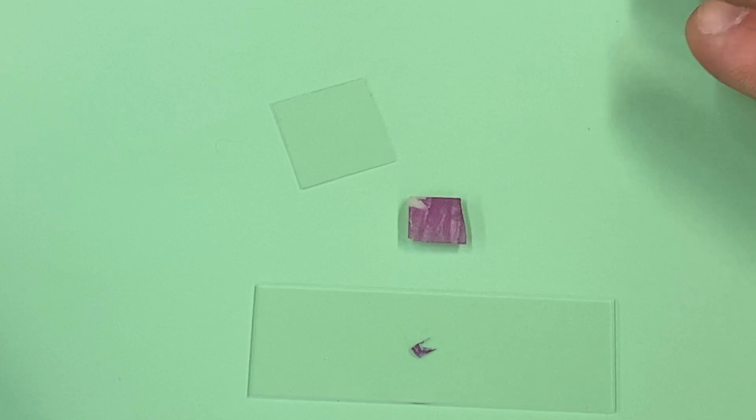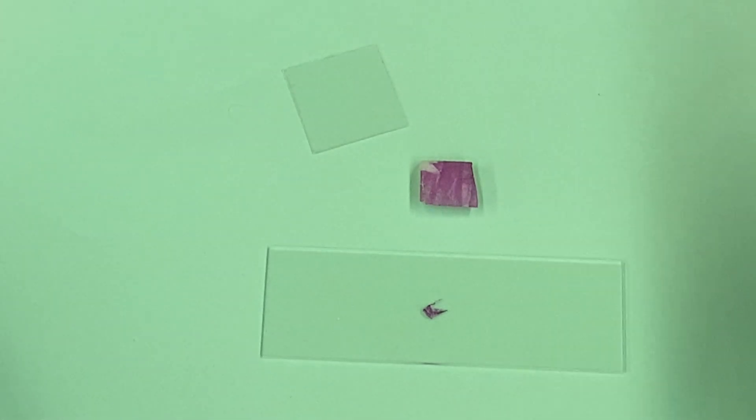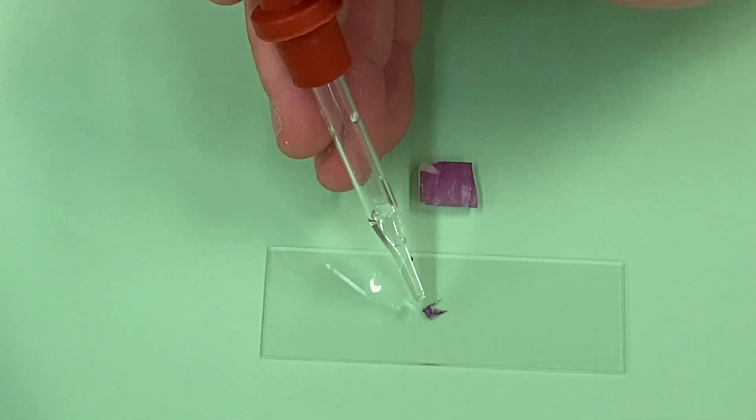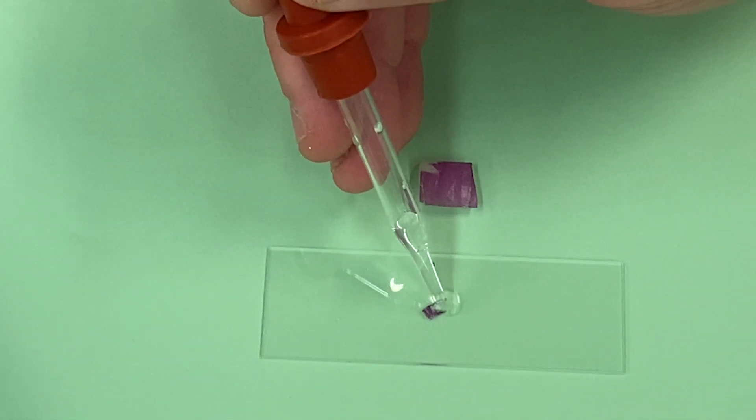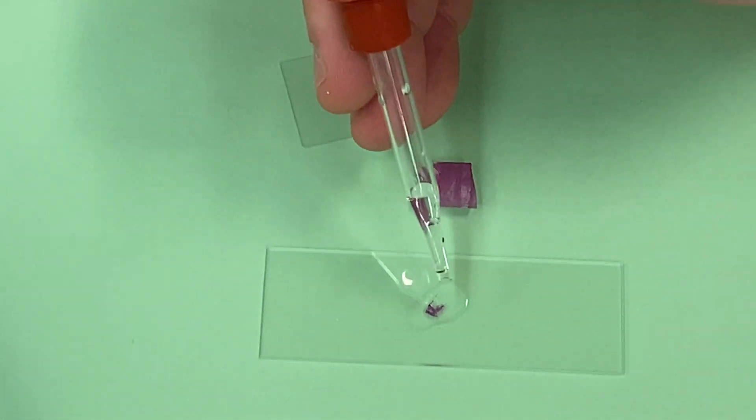So we have the little piece of onion epidermis on there. We're going to put just a tiny, tiny bit of water, right on it or right next to it would be even better, just enough to kind of float it.